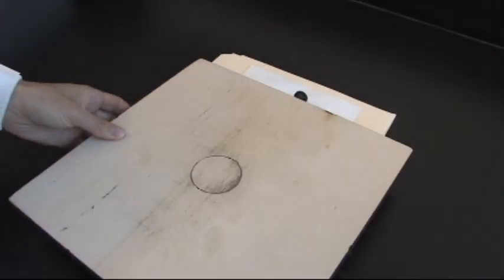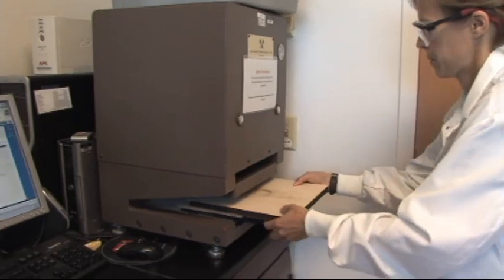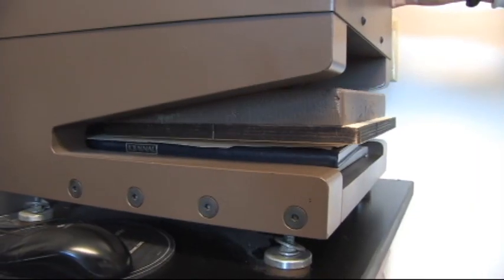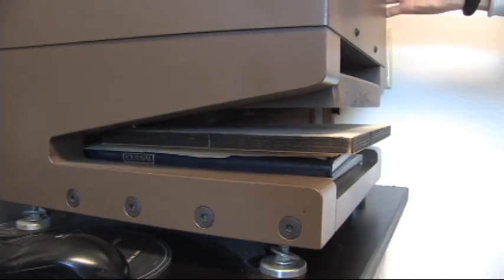Samples are cut into 47 millimeter discs and are usually sterilized prior to testing, both to incorporate any material changes that occur during sterilization and to reduce extraneous bacteria.